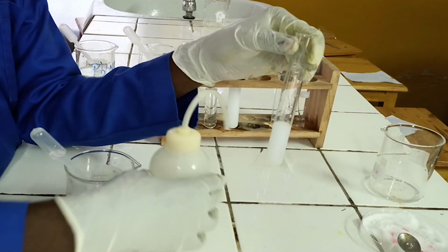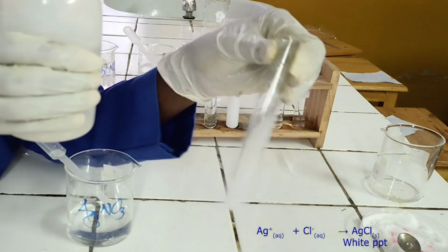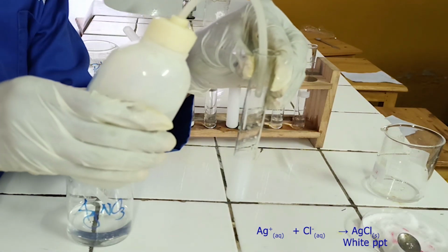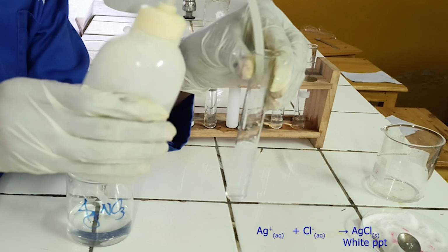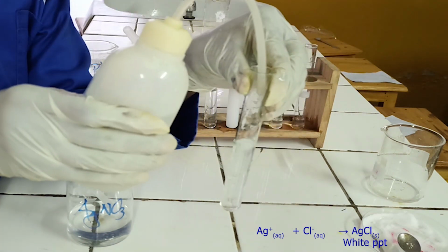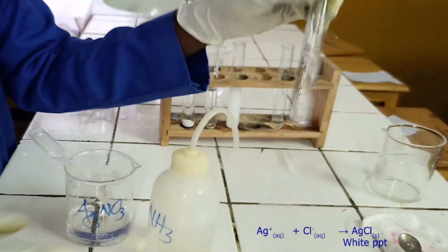As you see, silver nitrate solution reacts with chloride ion to form white precipitate. The precipitate formed is soluble in excess of diluted ammonia. Below, there is the ionic equation for this reaction.